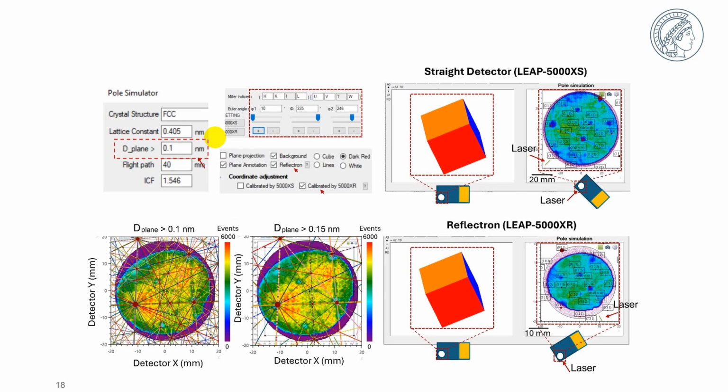So here, by checking this box, then we will automatically rotate the detector or rotate your reference. So for example, here if you place your sample on your clip holder like this, then if you check this XS, now it is the exact coordinate that the sample is facing to you.